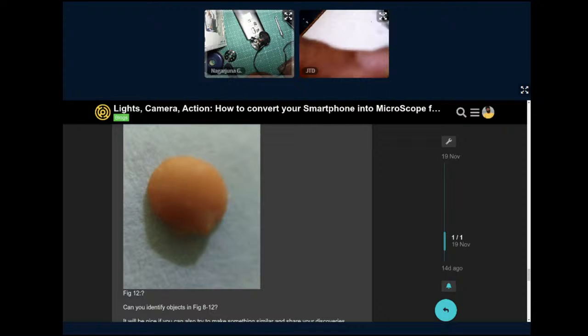So can you see some glass beads? Yeah. Okay, so these are 2 mm glass beads. Where did you get these? Well, I bought a lot of them. Oh, nice. But the only problem is that they are not good quality. They are spherical, but their transparency is not very good. But interestingly, what I did is a little bit of jugaad like this.